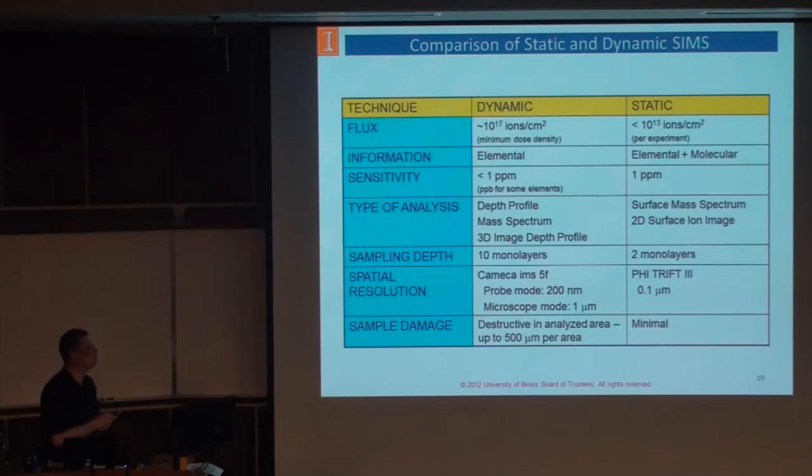Working in the static regime gives you an advantage, because in dynamic, you basically can only get elemental information, but if you work in the static regime, you get elemental and molecular, and so a lot of chemists are using that for their work.